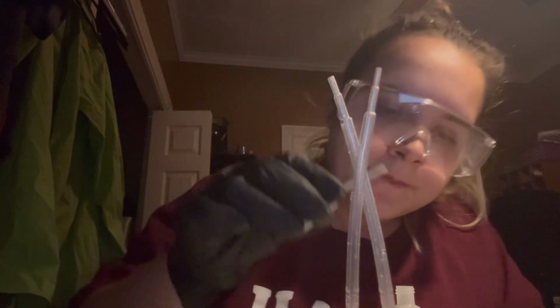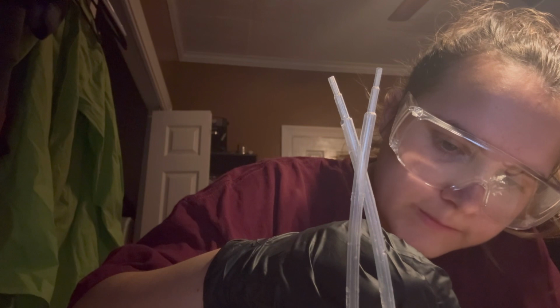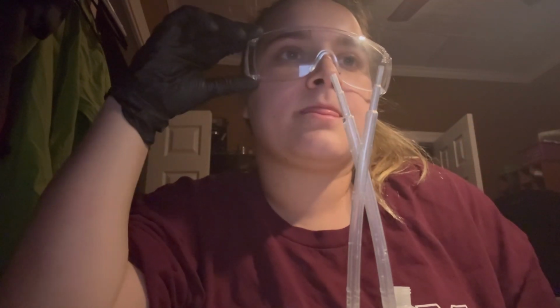So here's the D1. Okay. So 2 drops. Then we'll test the pH of the solution. So it has gone down to around a 5 pH. And now it says to repeat it an additional 4 times. So I'll show y'all the results of that.